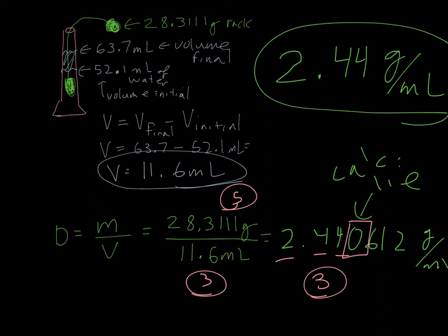And chemistry is easy and life is hard, yes? Straightforward, easy to do experiment.